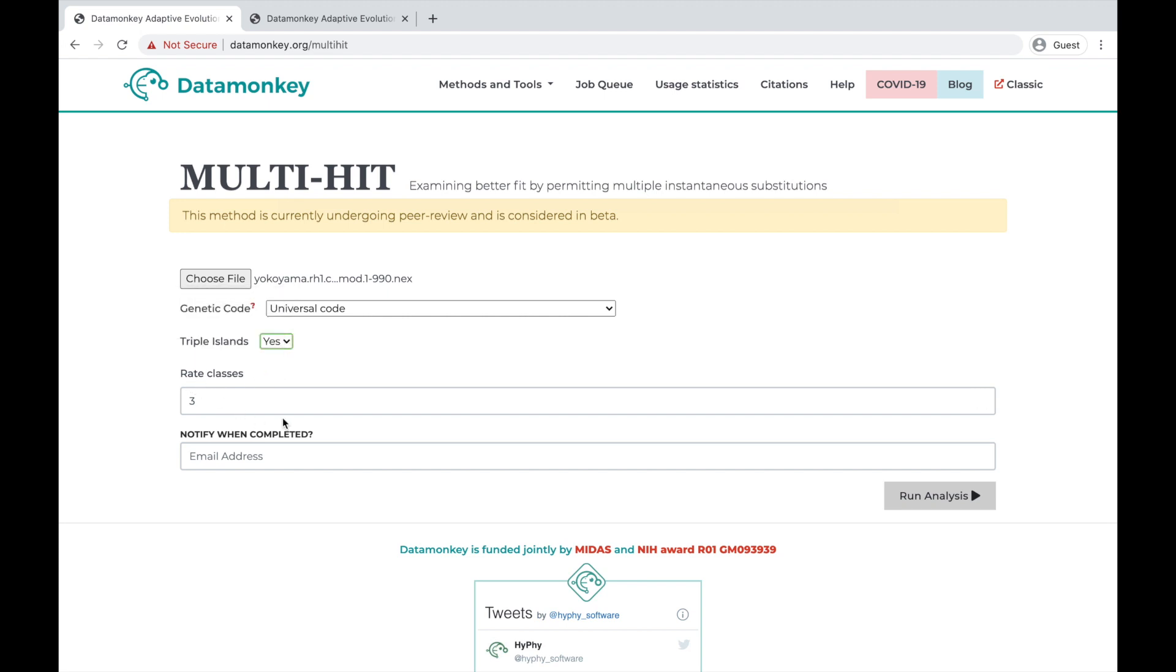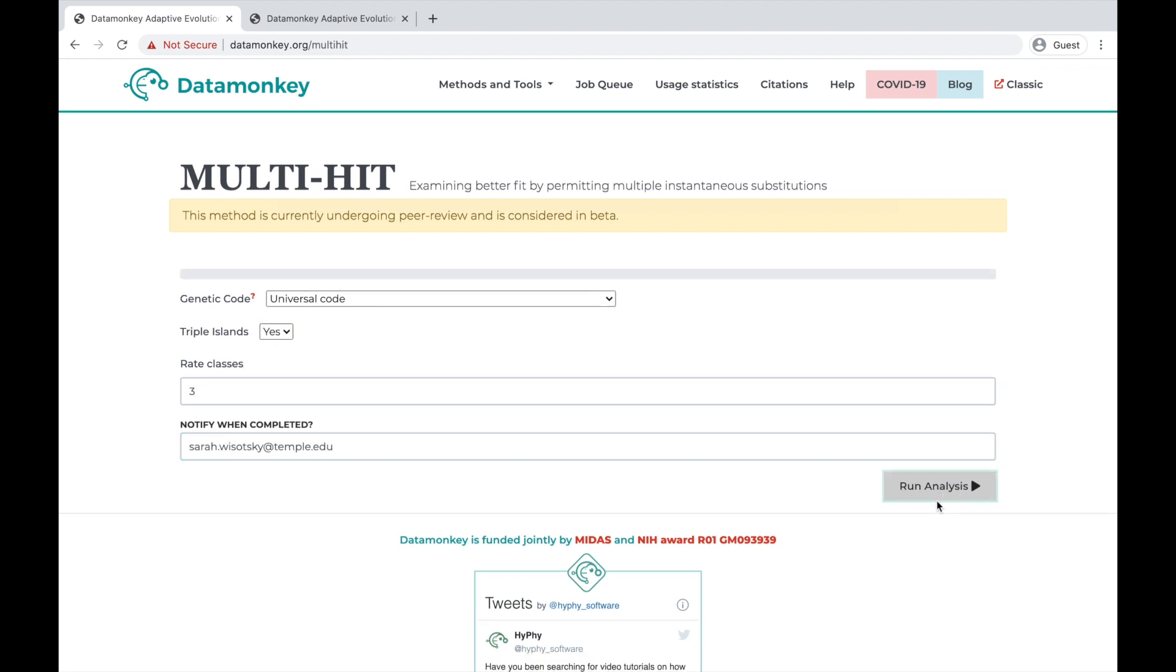Then, decide how many rate classes you want to use, enter your email, and hit Run Analysis.